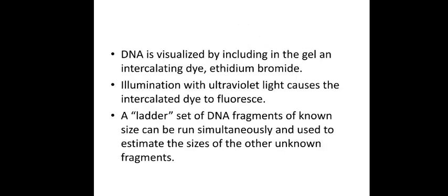Once it is run, then you have to visualize the movement, which is done by ethidium bromide, so that you will know exactly where it has moved.